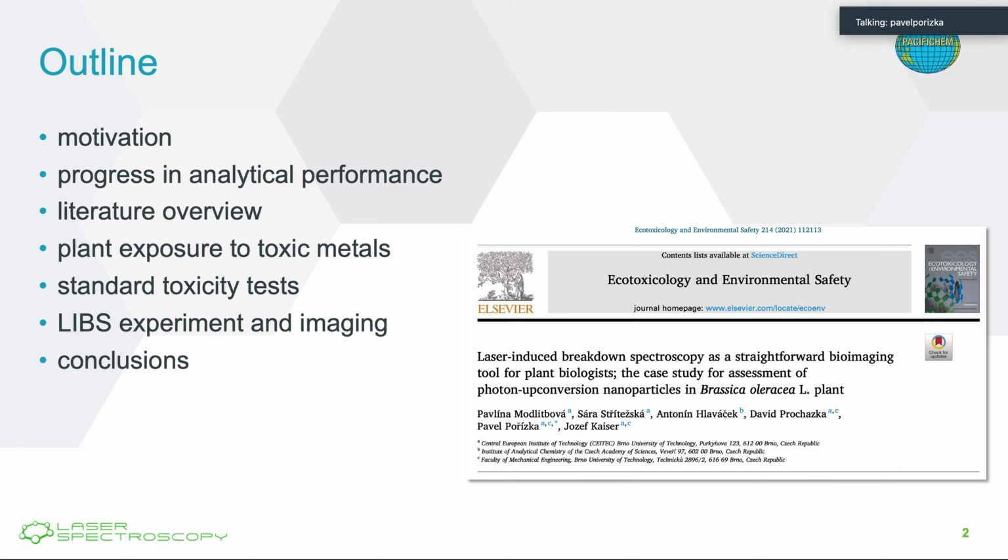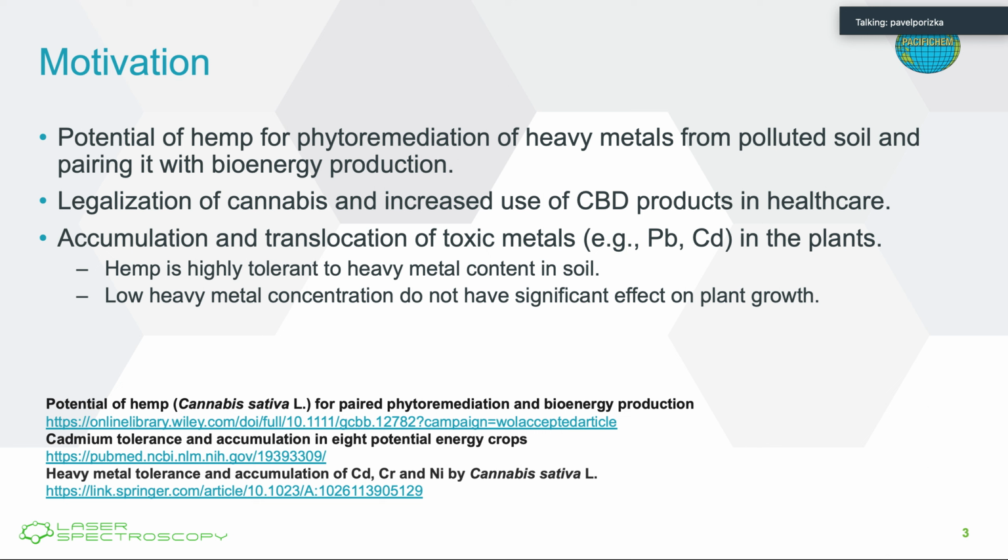We are using upconversion nanoparticles in this case. I will maybe explain why later. So the motivation right now, especially related to cannabis, feel free to extend what I'm speaking about here, because I'm quite new to this field. I'm more on the LIBS side, providing this service in elemental analysis.